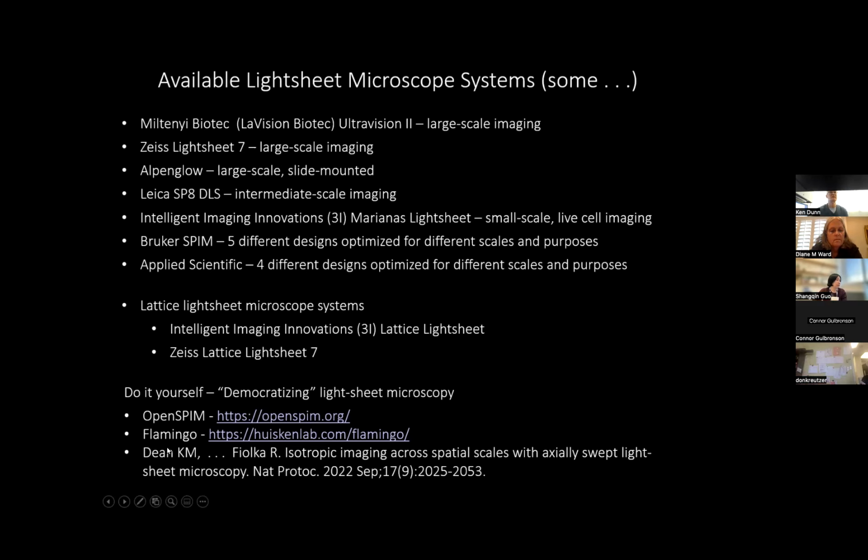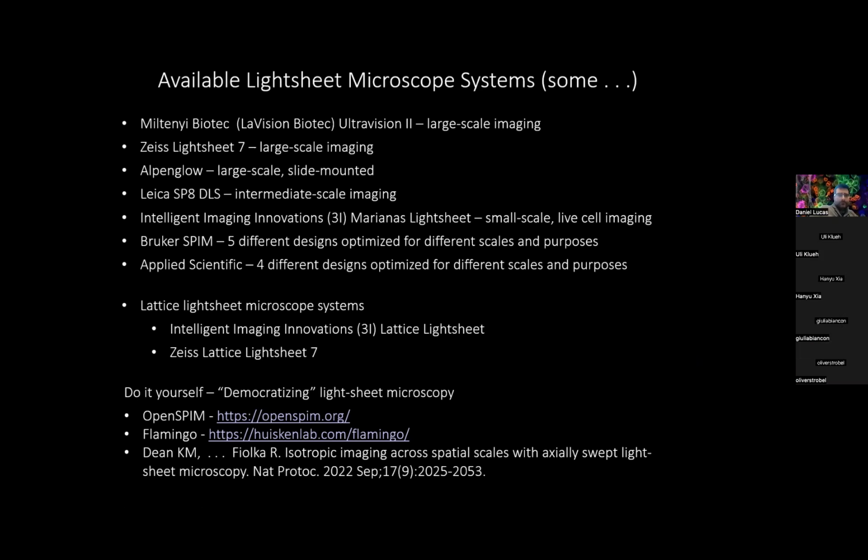Jan Huisken, his lab, he's all about democratizing light sheet microscopy. He has this Flamingo website that describes all the things you need to know, and I think provides you with a lot of it. And then finally, this very high-tech system from Rito Fialka. It doesn't provide the design, but he has a very elaborately described technique and system, again in the interest of democratizing it. Unlike a lot of things, like confocal microscopy, which is not for the faint-hearted to build their own system, light sheet microscopy is not that difficult to put together if you've got some skills and some time.